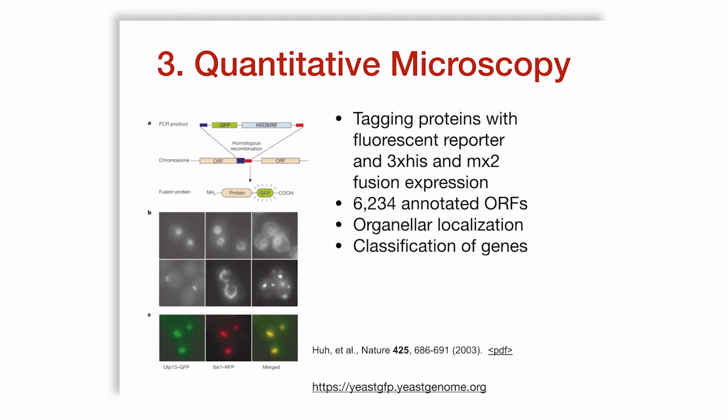This is a very popular method, partly because you get not just the identity of proteins, for example here, but also their location. Not just location, but even their dynamics. This is very powerful, as you imagine, because unlike in the case of 2D electrophoresis and electron microscopy, these are fixed snapshots from a specific time point.